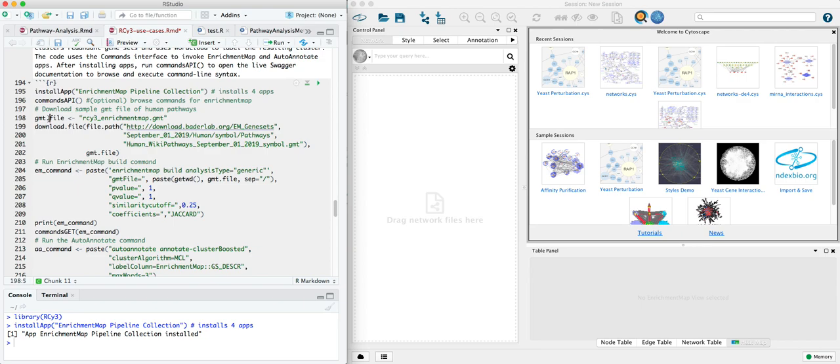Here we're going to use the entire WikiPathways GMT. That's a mapping of pathways and gene terms. If you have run an enrichment analysis using GO or Pathways, you can load instead a GMT of the subset and enriched terms and genes from your analysis.